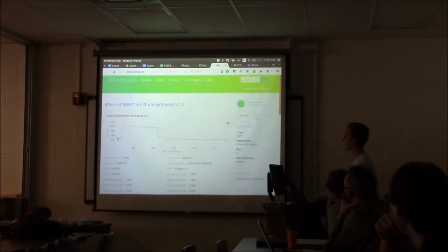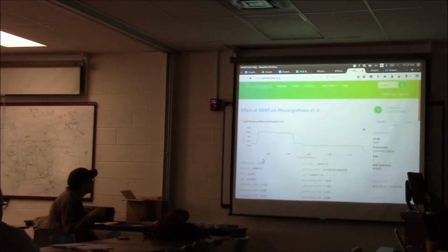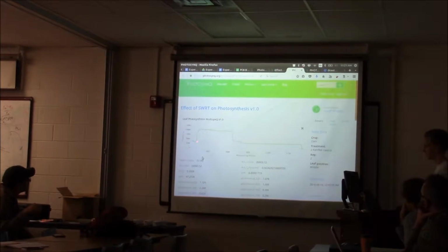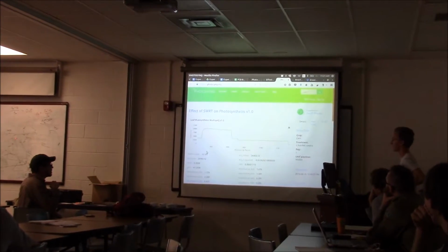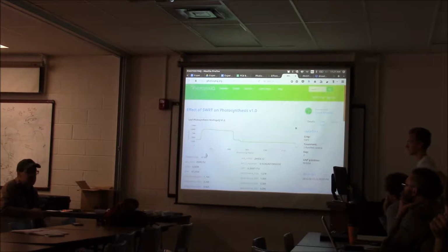Sure, yeah. This is your steady state fluorescence at that phase. And your saturation pulse is going to apply here. What it's doing is closing those reaction centers and building up the electrons in here. Now there's a trick. You see how it goes down like that? This is a trick invented by my former student.